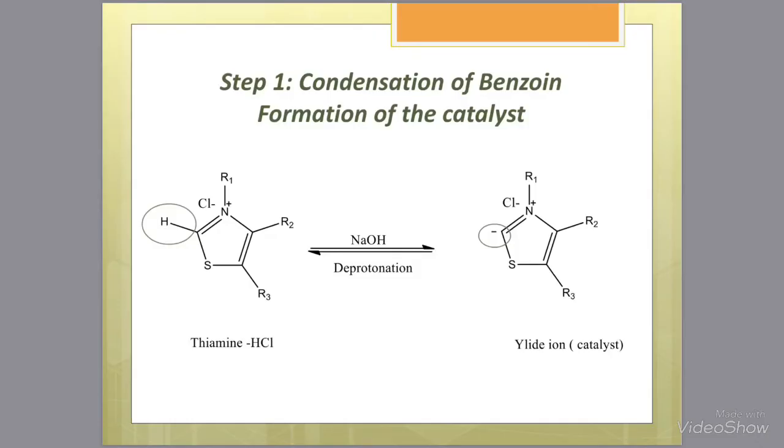Keep in mind that the thiamine compound is a heat-sensitive compound and may decompose if heated too vigorously. So, instead of running the reaction at elevated temperature for a few hours, we will allow the reaction to proceed closer to room temperature for at least 24 hours.